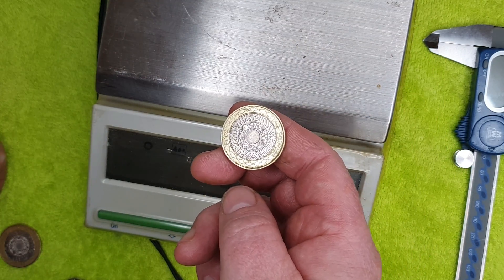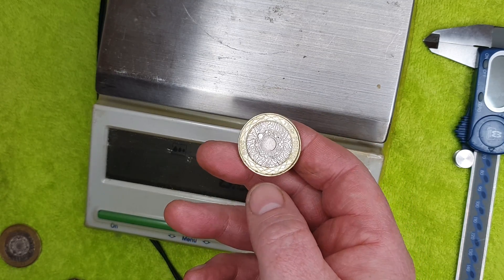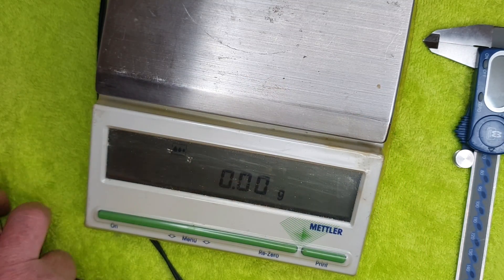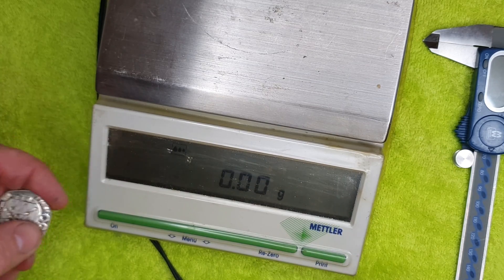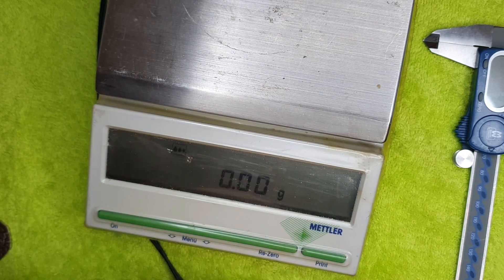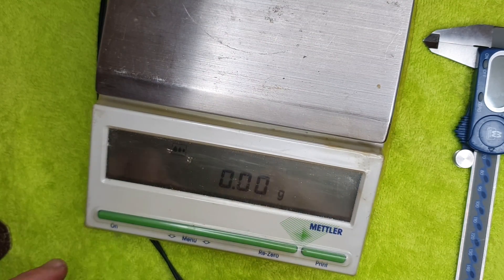So the fake two pound coins are very similar to the real deal in both weight and size, though they obviously look very rough. The conclusion from the weight and size tests is that the fake large 50p is lighter, the fake Kew Gardens is lighter and smaller, but the fake two pound coins are actually very close to spec.